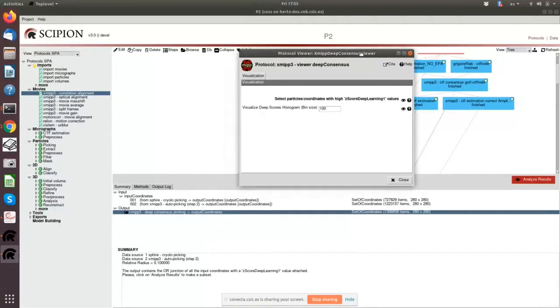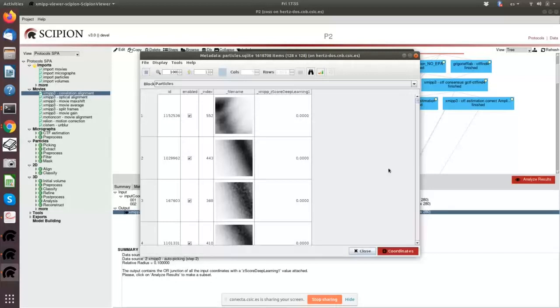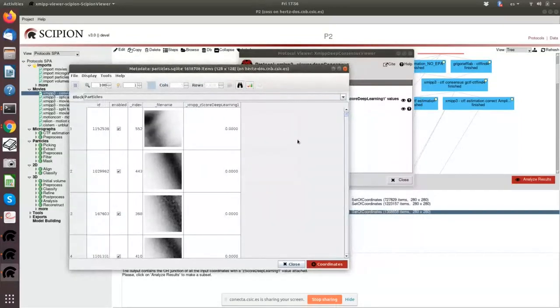So for instance, here you see we entered with 1.2 million and 0.7 million. There were 1.3 million that were different, that had different coordinates. So this 0.7 was a subset of the other one. And then you see that the ones with 0 are completely crap things.